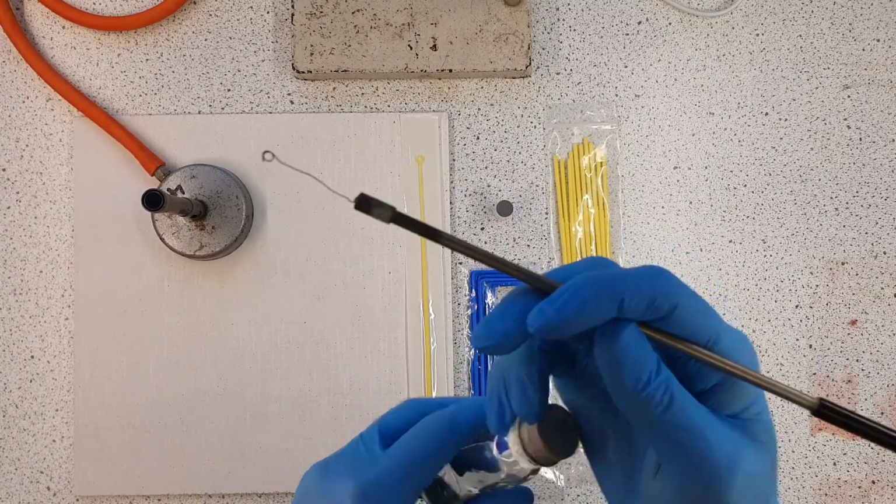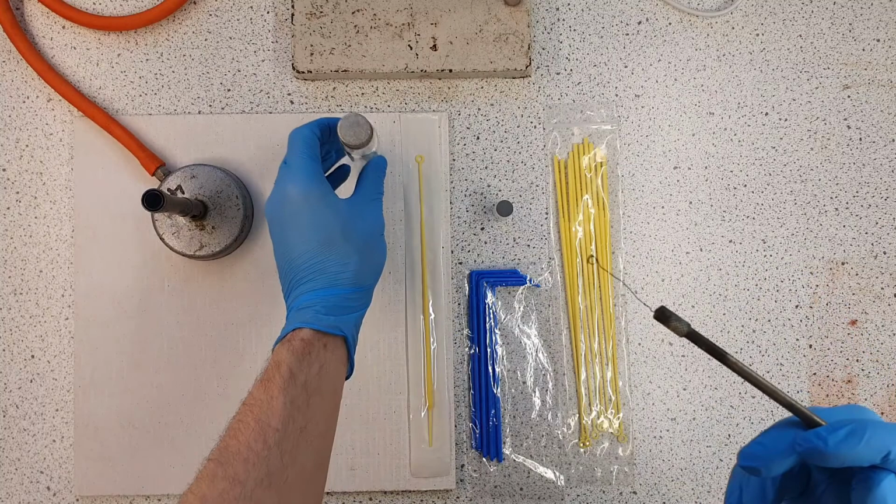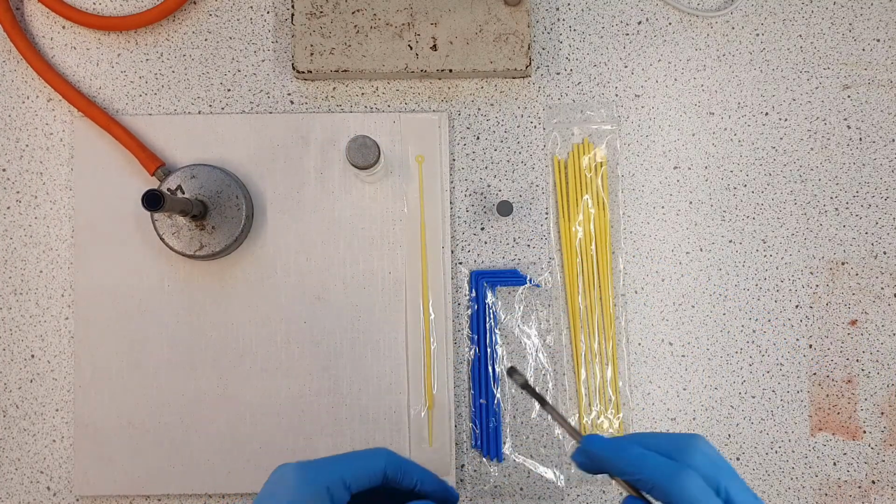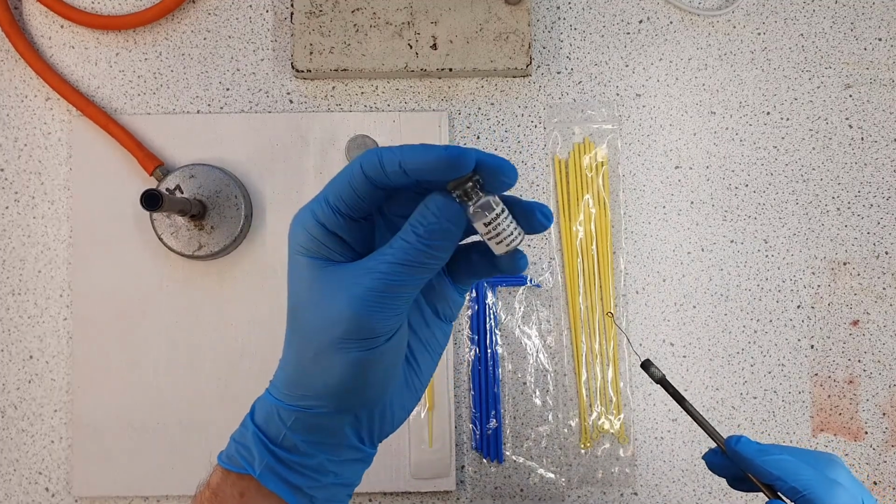So that's now nice and tight, a bit warm. We can now set that down because it's sealed, so there's no interior contamination. And the same will go for smaller bottles with rubber stoppers.